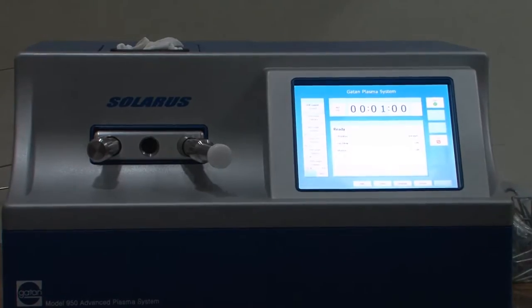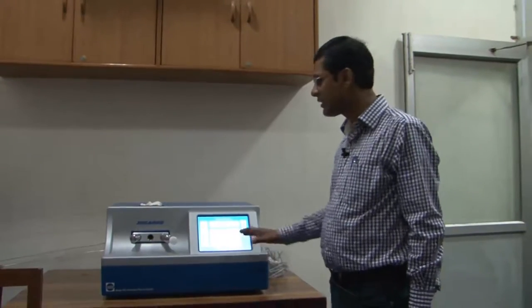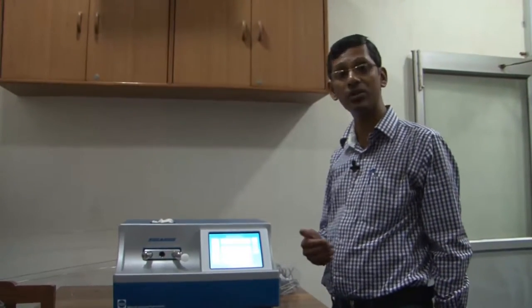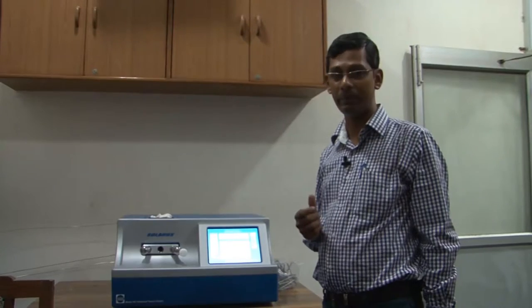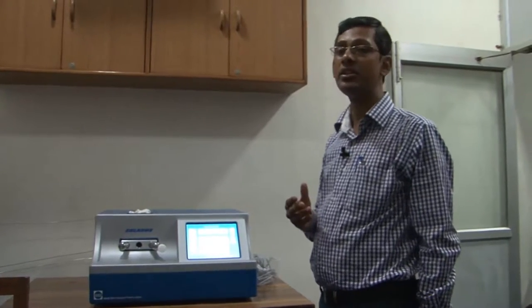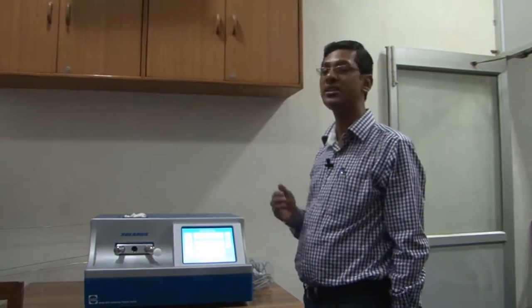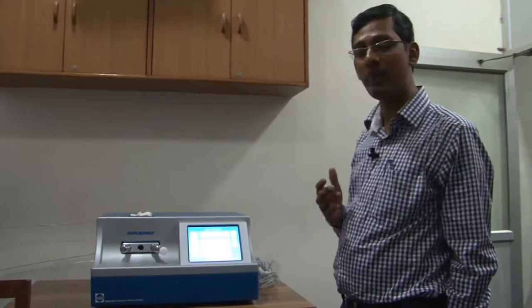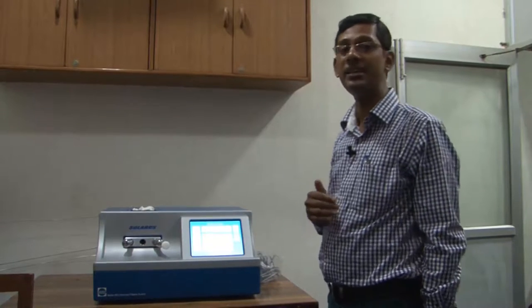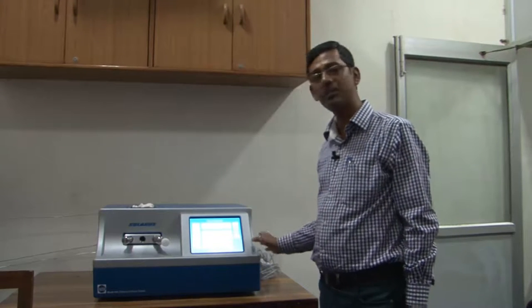This is a very fast and very authentic technique to get the sample contamination free. This is very important for many analyses, not only high resolution but also composition analysis, and also in STEM, because in STEM we use a converged beam, and if the sample has contaminations, the converged beam will interact with the contamination and the sample will become more contaminated as the investigation goes on. That's why these days all microscopy samples need to be first cleaned in a plasma cleaner before you put them inside the TEM column. That also saves the vacuum system of the TEM column. So this has been a new feature.